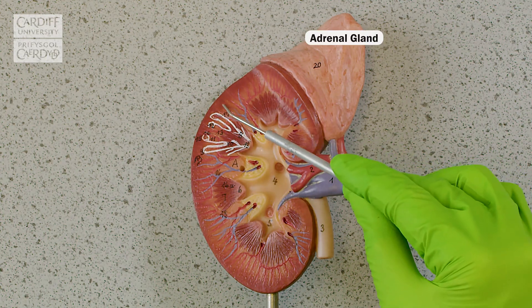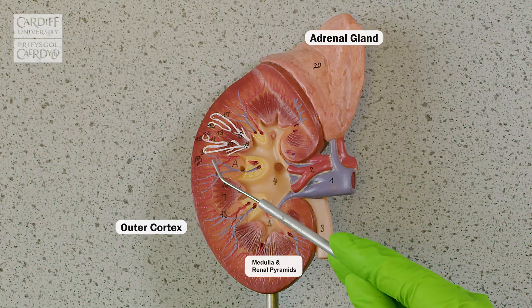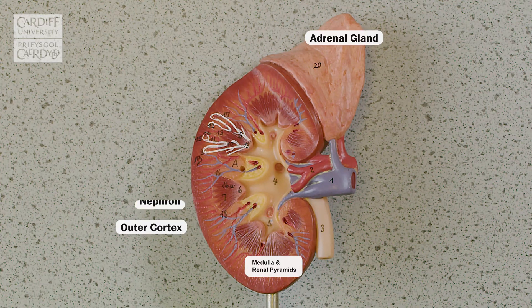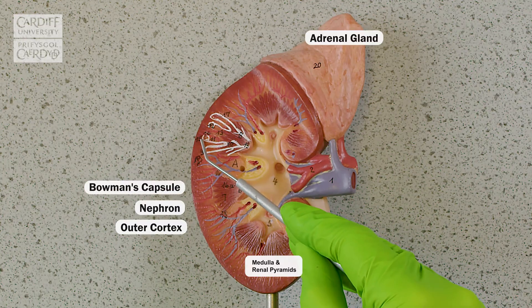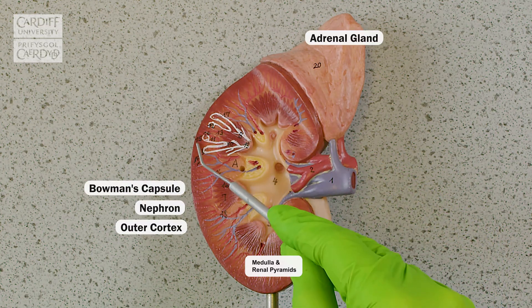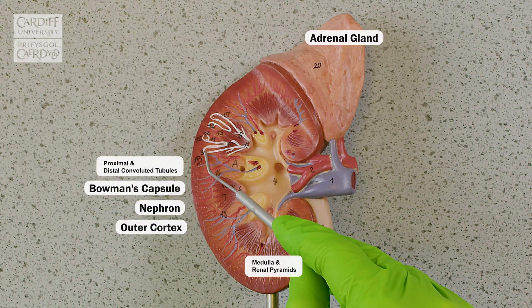We've got the outer cortex and our inner medulla and those pyramids. And here, what you can see drawn on is our nephron, that functional unit of the kidney. You can see the Bowman's capsule located within the cortex — that capsule, the proximal and distal convoluted tubules.